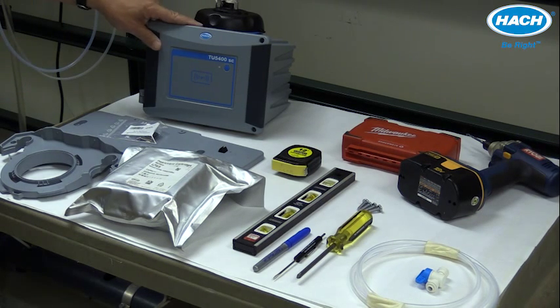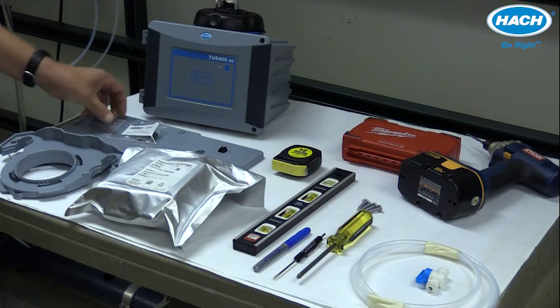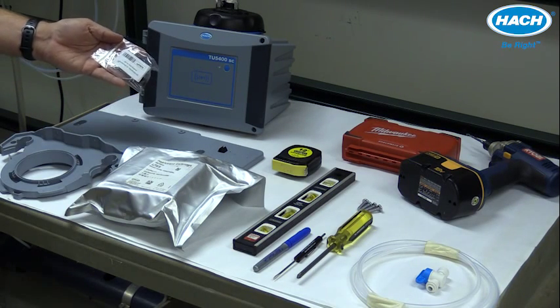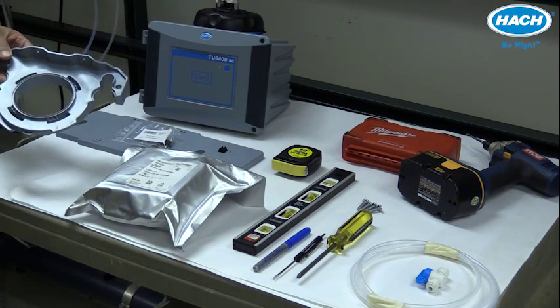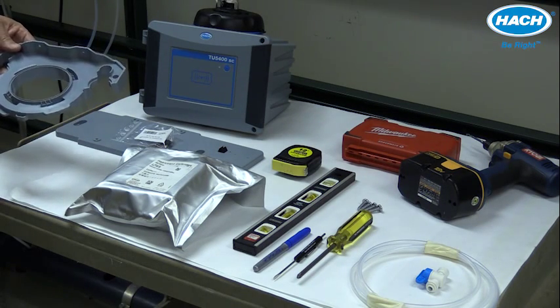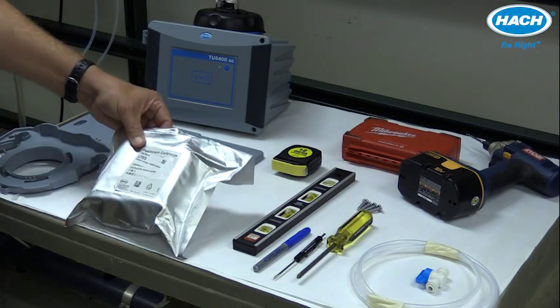In addition to the instrument itself, you'll need the mounting bracket and the associated hardware, the maintenance rack — which, by the way, is only included with the TU5400 process turbine meter — and the desiccant cartridge.